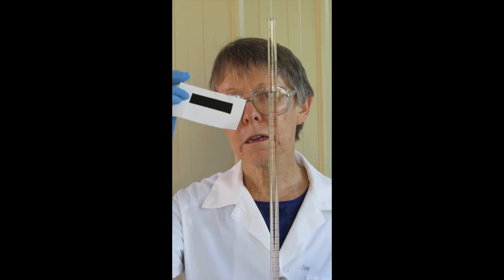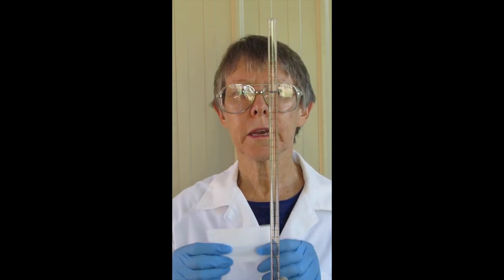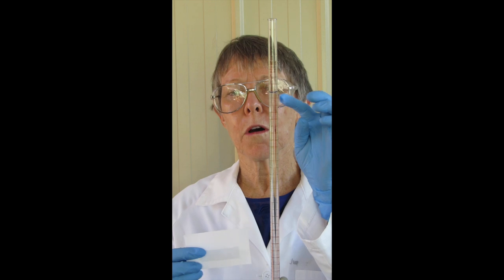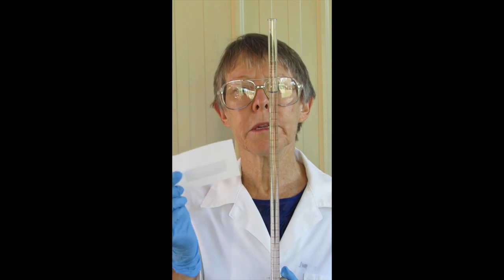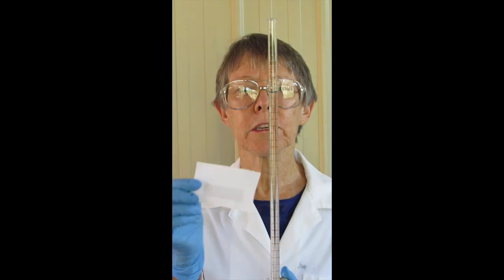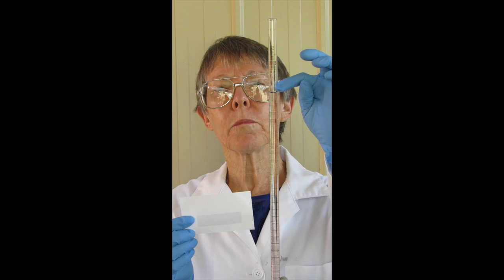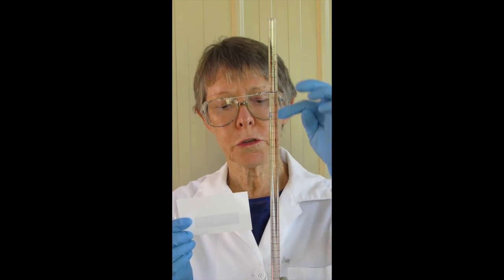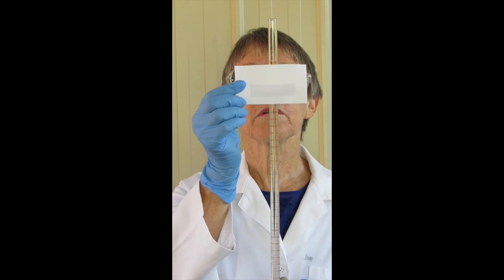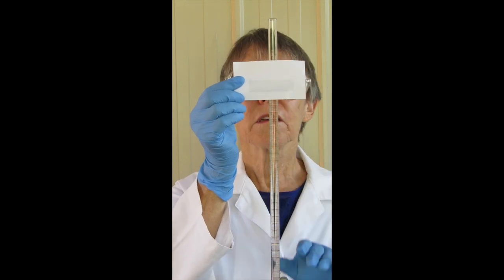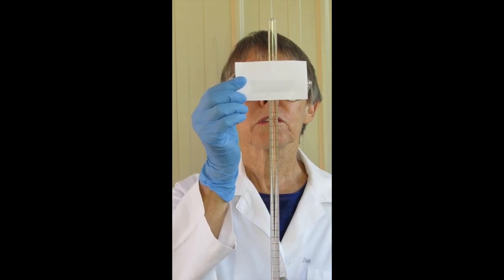The burette reading card helps get a better view of the bottom of the meniscus. We're looking for the point where the very bottom of the meniscus curve is against the graduations. Remember we read from the top down, so it goes 2 down to 50. Hold this up and read your burette to two decimal places.